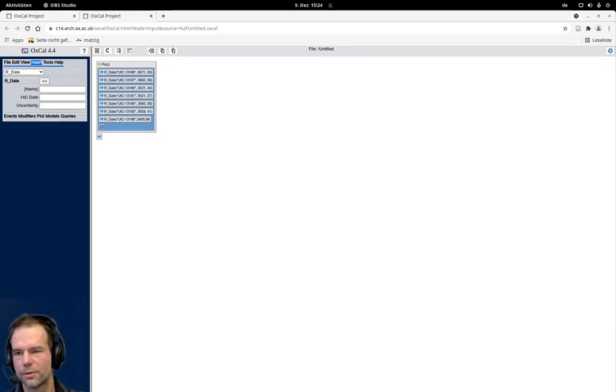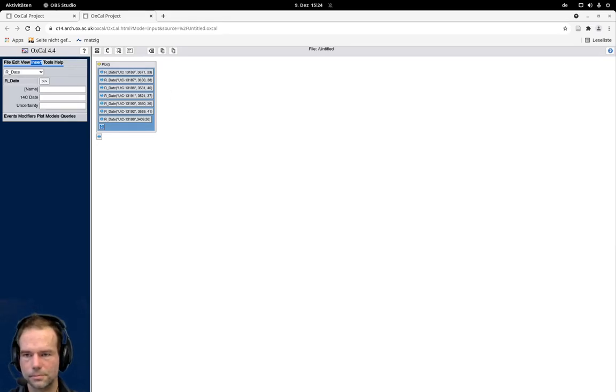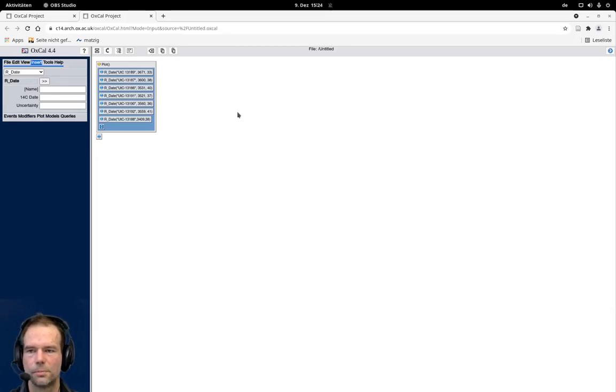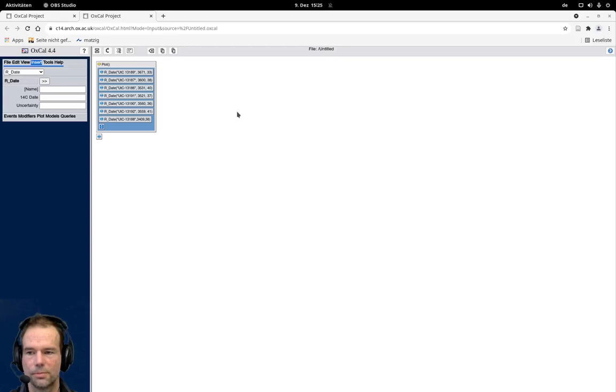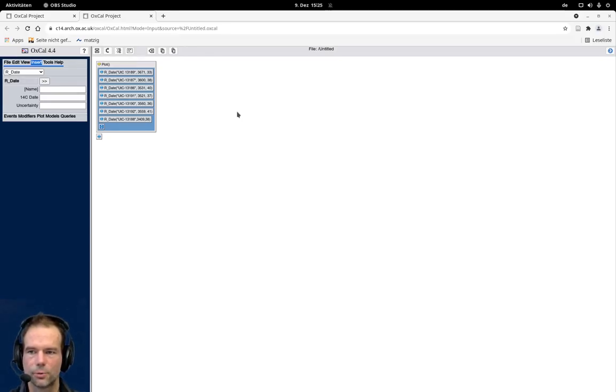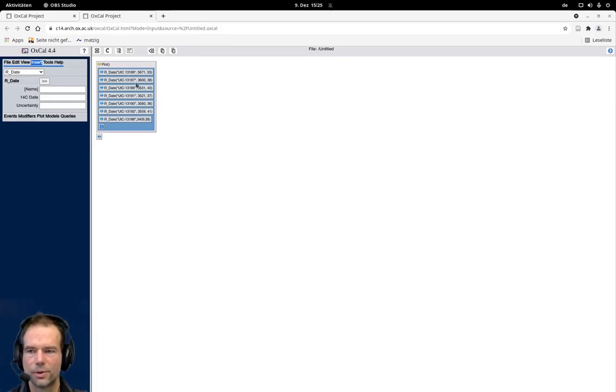So let's assume we have these dates here, and we know that these two first dates here can be combined because they represent the same event. Probably they come from the same individual, probably two different bones from the same individual, and we have these two different dates, and we will come up with a more precise date. So if we just individually calibrate them, I can click here on this arrow.